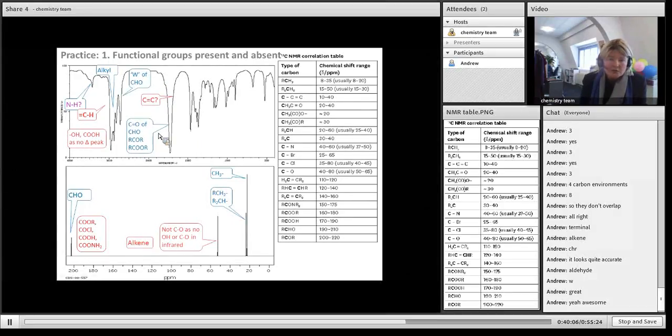Now we go to the far right. There is the carbonyl. There's my carbonyl. They match up. And if you look at the area, it's in the right place for an aldehyde. So mention that. And then say we know it's an aldehyde, not a ketone, because we've got that very clear W over there. Now you would then go in and explain a bit more what this one is from.